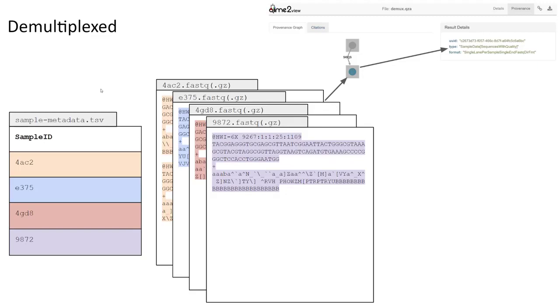And of course, when you are working within the QIIME2 environment, you will only actually see a single QIIME2 artifact. However, we now know that the underlying structure of that artifact is a series of individual FASTQ files. In fact, if you were to export this artifact at this point, you'll see that all of these FASTQ files exist as a separate file within it.